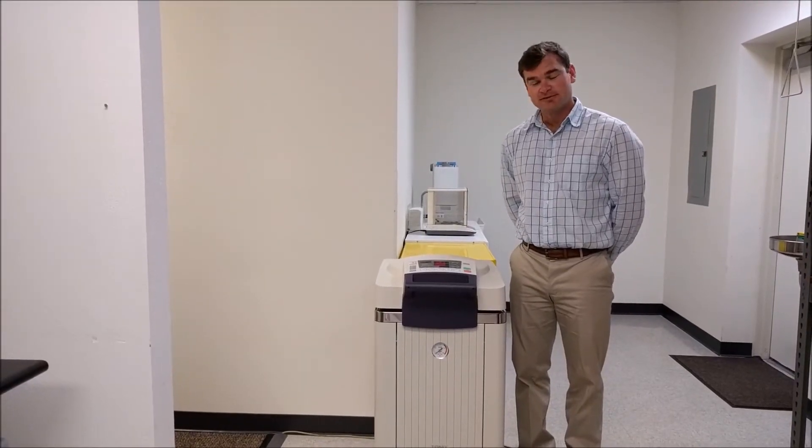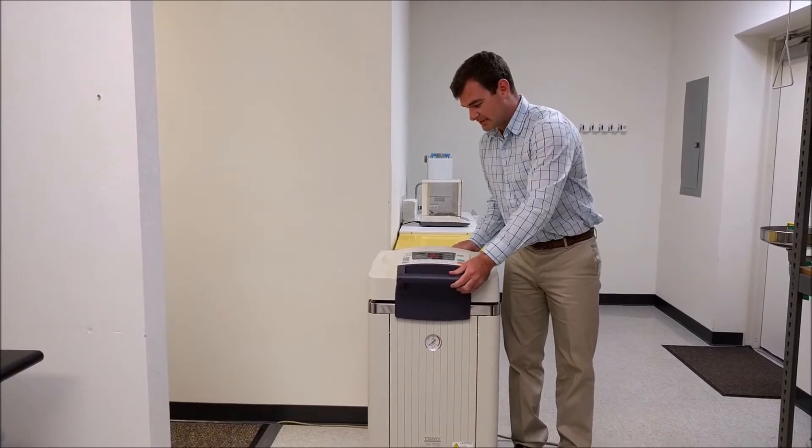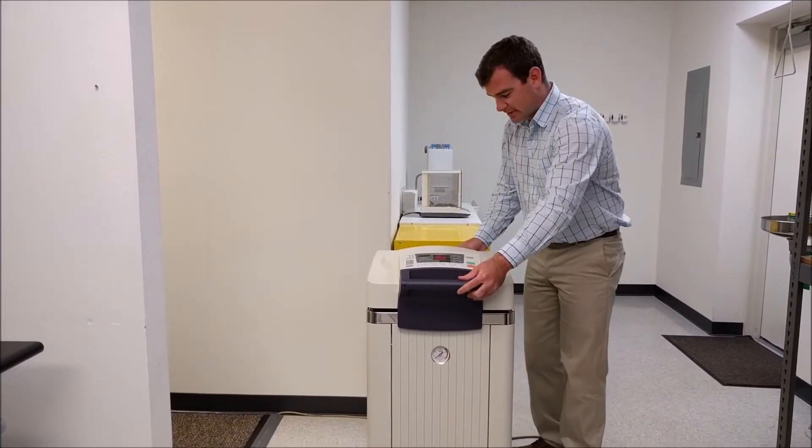The system is portable and very easy to use thanks to the wheels. Anybody can move it around to a different lab if they needed to.